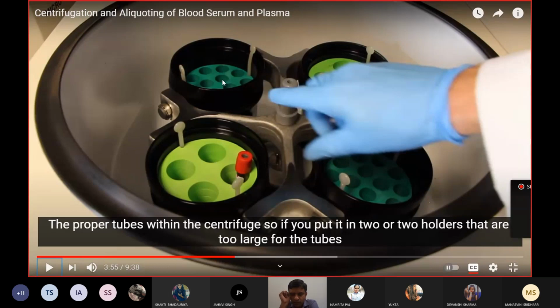And another thing, is it okay if I just put one tube here and centrifuge? No, sir, you'd have to put another tube in the opposite one in order to balance it out. Yes. But suppose you just have one sample, then what will you do? So you can just put maybe a tube of water or something.